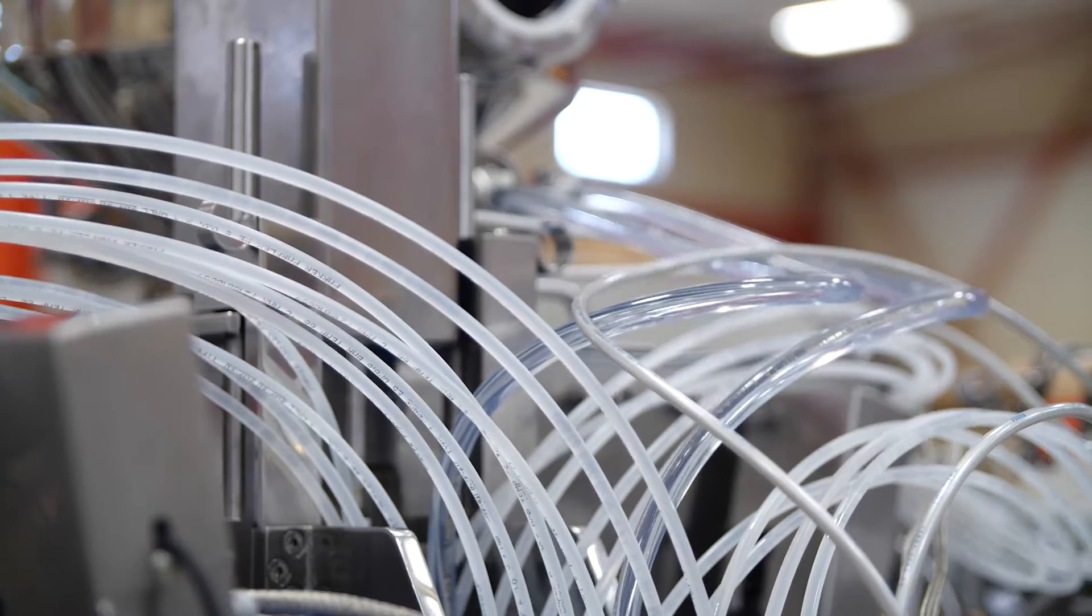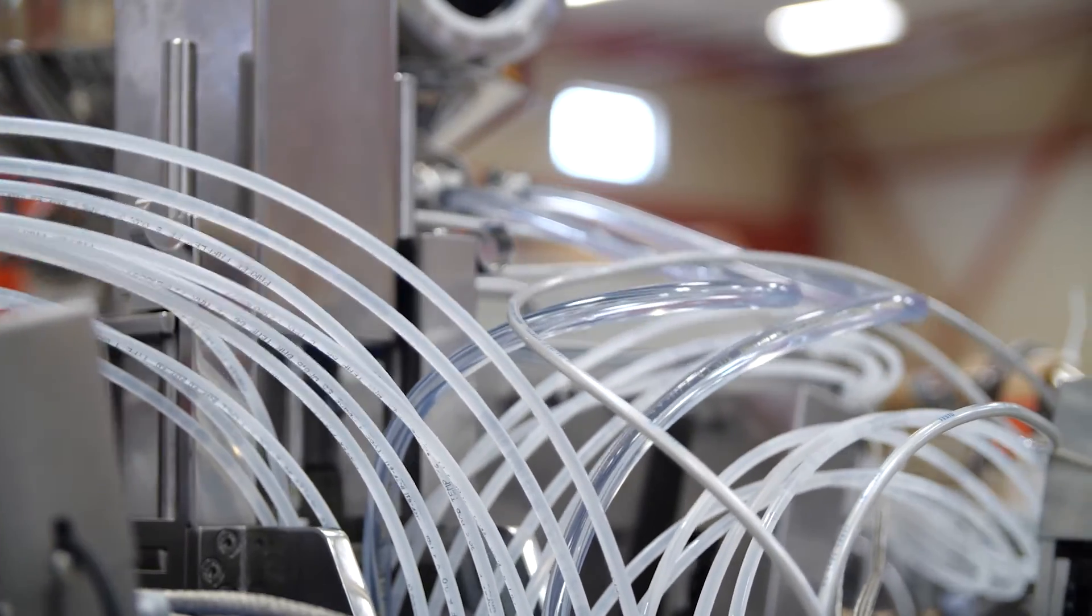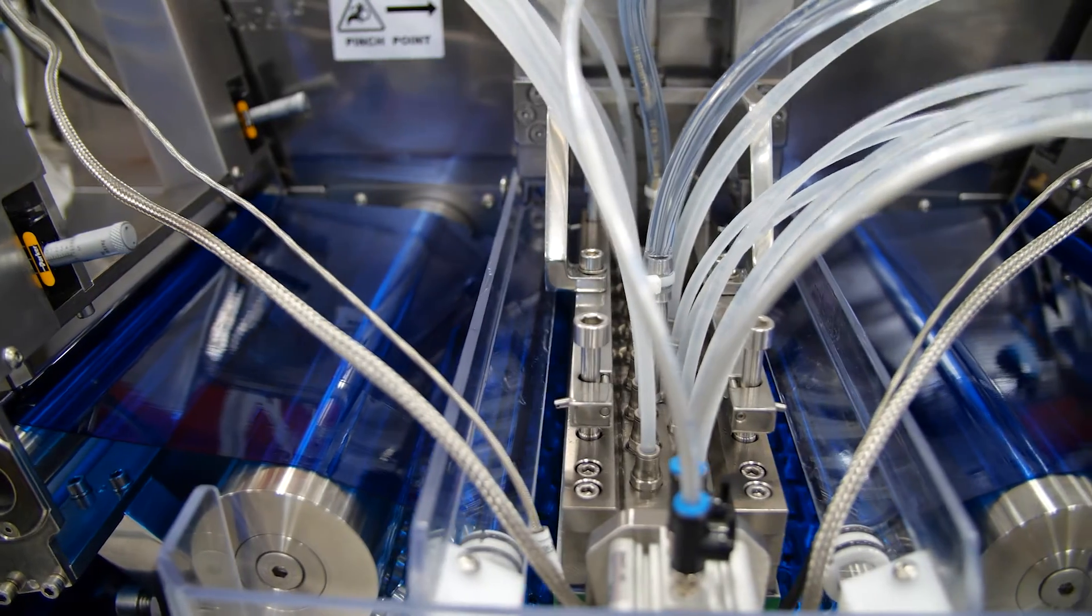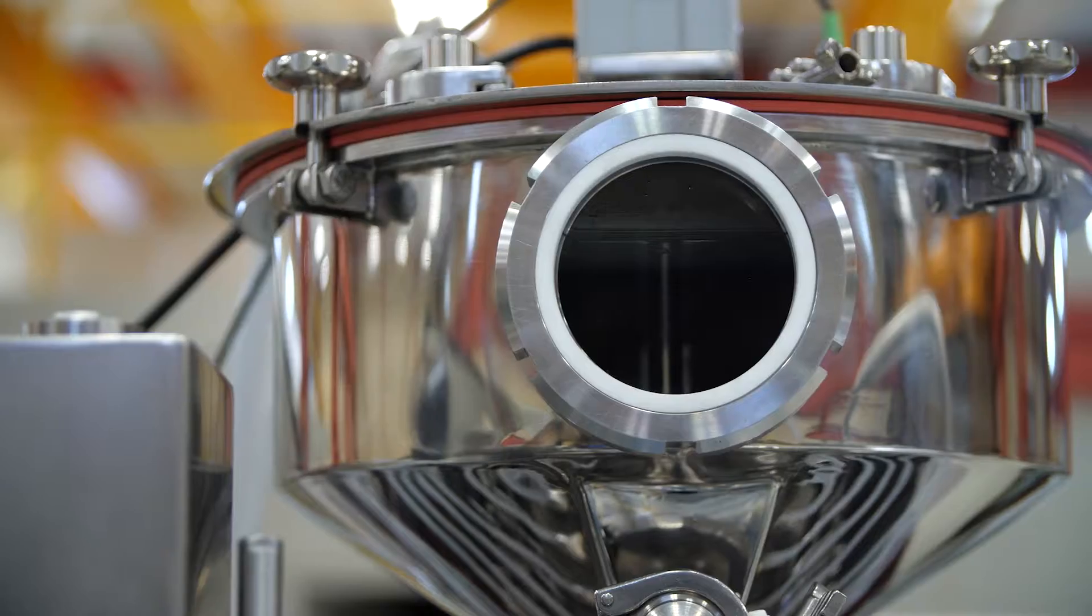The ingredients are fed into the machine through the use of gravity, through a specialized pumping system, or through the use of pressurized tanks.